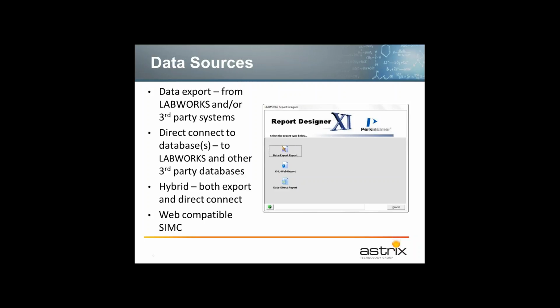And then the fourth type, which we're not getting into today, is a web-compatible SIMC report. It's an XML-based report that's used for the LabWorks web module. We can cover that in a separate seminar.